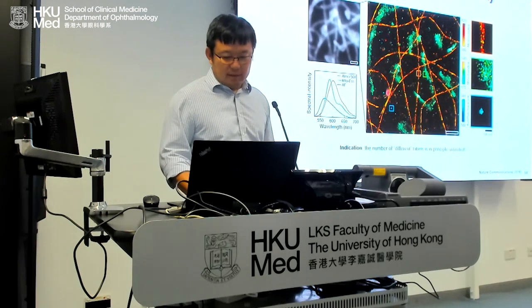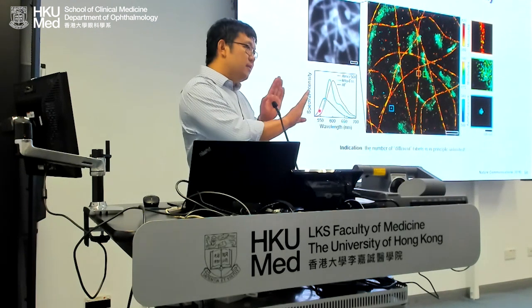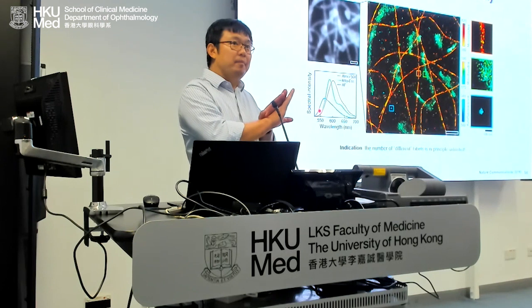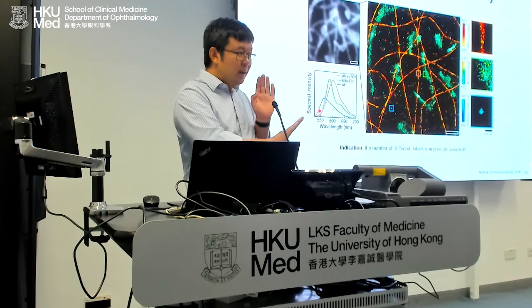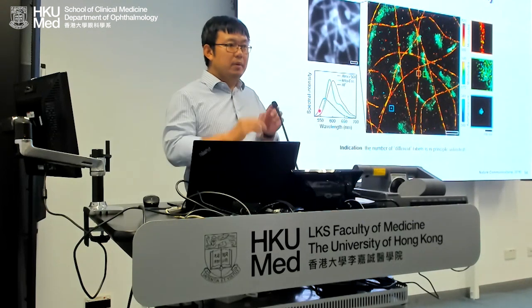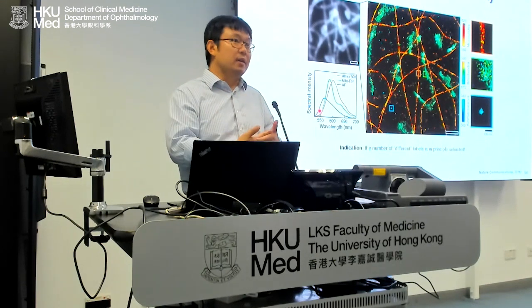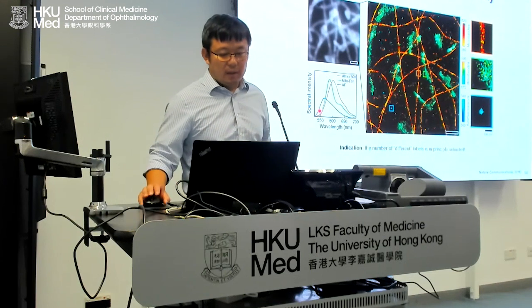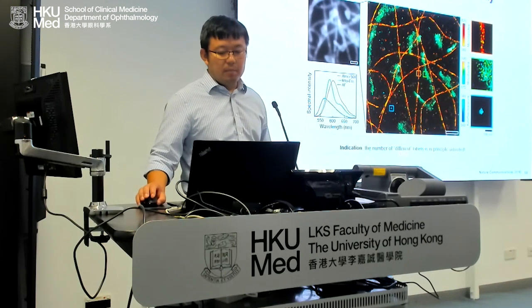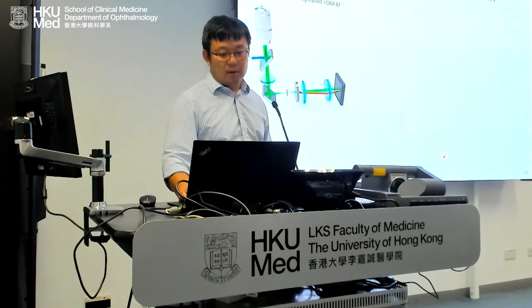What is that? So these are molecules whose fluorescence emissions are almost the same. So using traditional optical method, they are the same. You cannot separate them. But because we know the whole rainbow, numerically, we know they're different, and we can reprocess that. So that's actually the beauty of it. And what's the implication? The number of different labels are unlimited because we just numerically analyze all this.